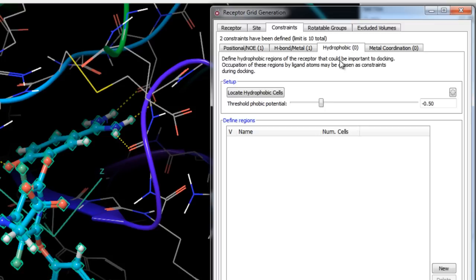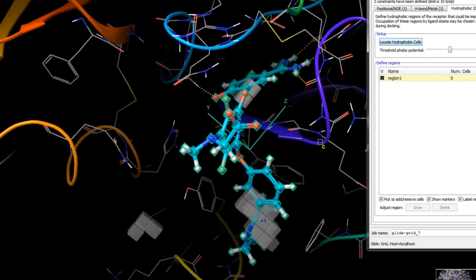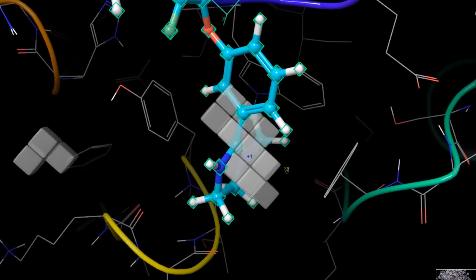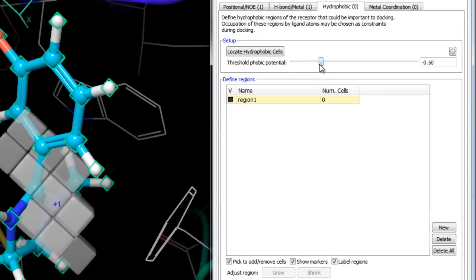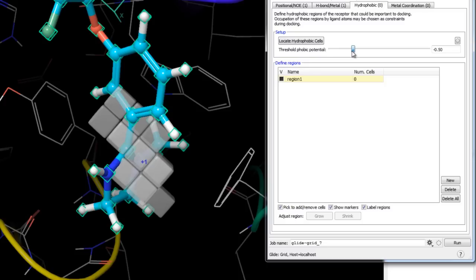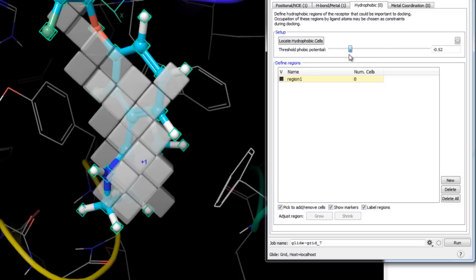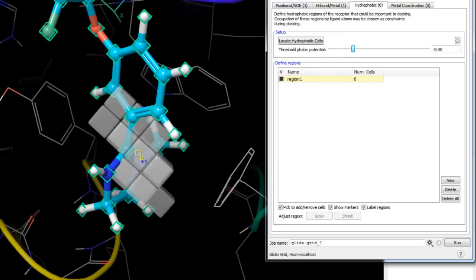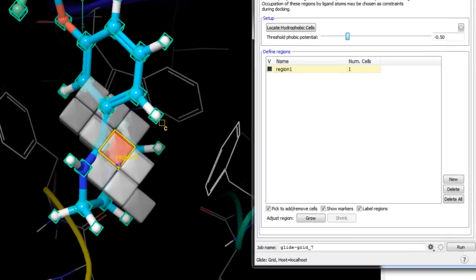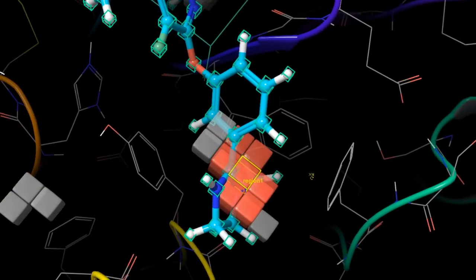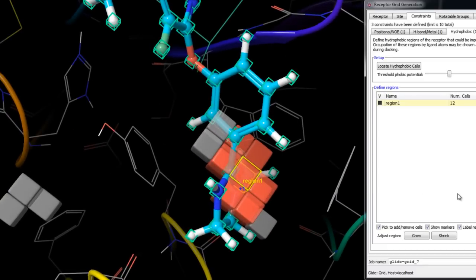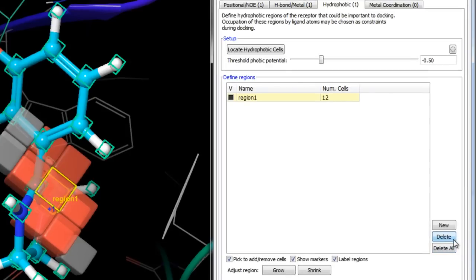The hydrophobic constraint requires a user-defined number of hydrophobic heavy atoms in the ligand to occupy a hydrophobic region in the active site. Press Locate Hydrophobic Cells to run a short job generating a hydrophobic map of the receptor site — translucent gray cubes will represent the hydrophobic regions. Adjust the threshold phobic potential with the slider to enlarge or diminish the hydrophobic region. Click on cells to select them or use Grow to expand the selection; red cells represent the hydrophobic constraint. In this exercise we'll delete this constraint in favor of the positional constraint already defined.